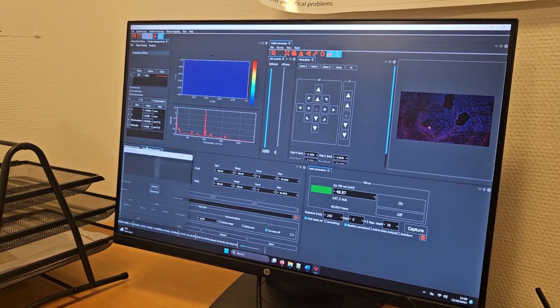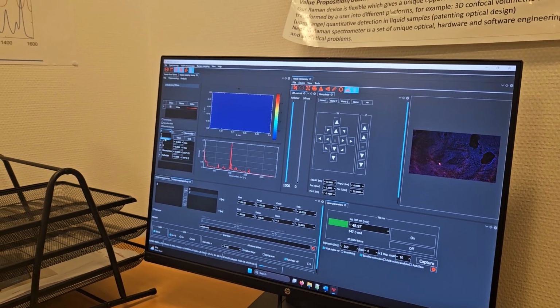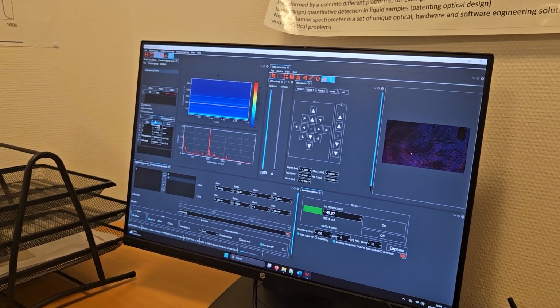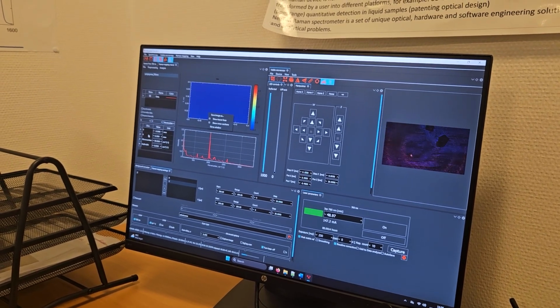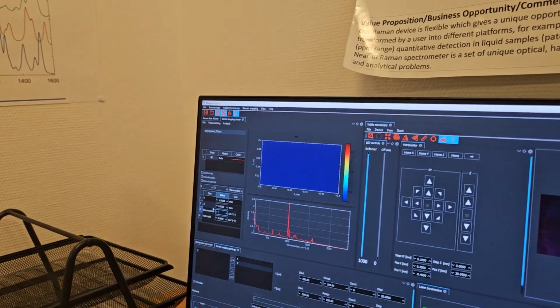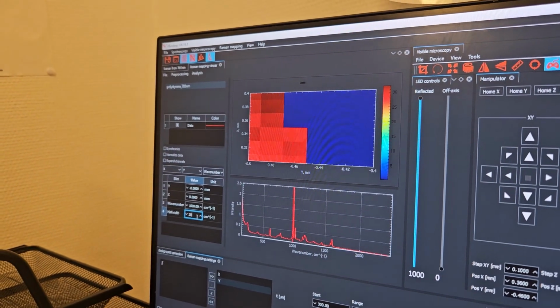Let's go to Raman mapping viewer. Here's Raman mapping viewer. We have to choose the proper coordinates. It should be, I believe, X, Y, wave number, and we choose the wave number, which would be, let's say, 1000, and with half width, let's say 20.